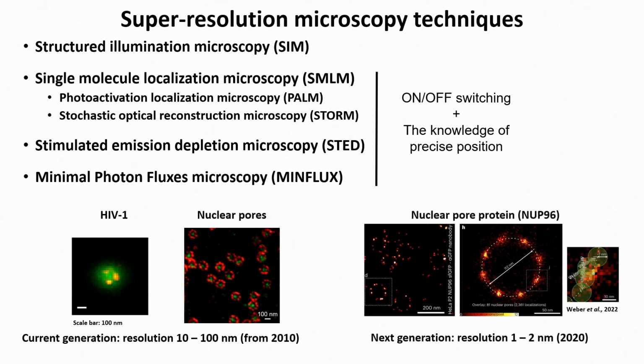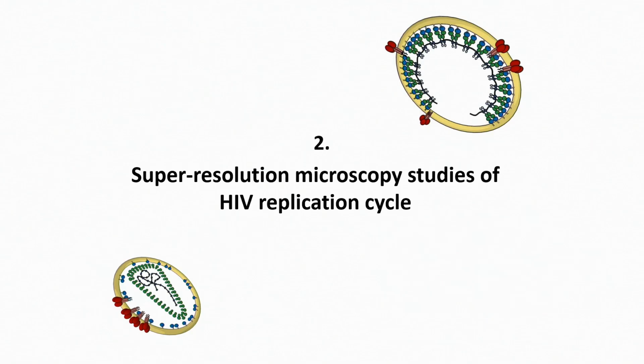Because right now already coming to the market, I would call a second generation of techniques which offer a fluorescence microscopy resolution of around 1 or 2 nanometers. So we're talking about a real molecular resolution in which the orientation of your fluorescent probe makes a difference. And those techniques are also becoming commercially available. So there has been an immense amount of research and innovation since the classical days of confocal. Definitely the field has moved on quite a lot since then.